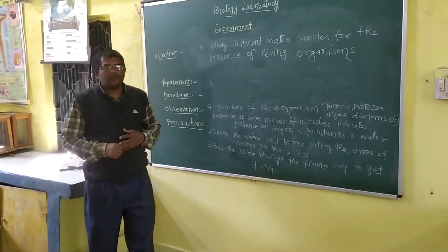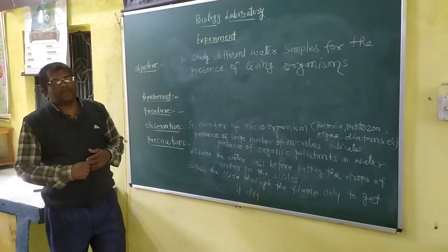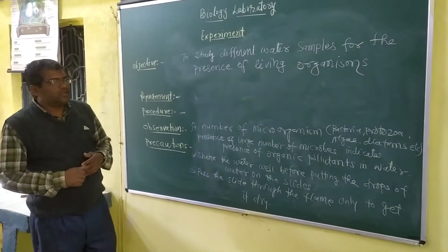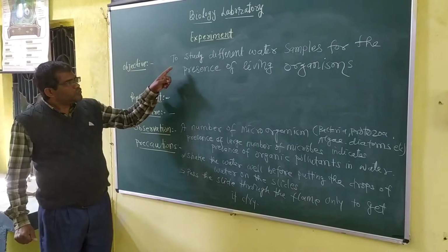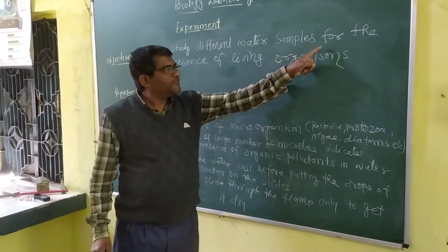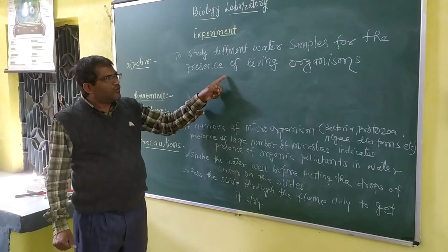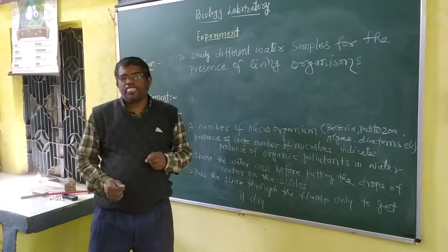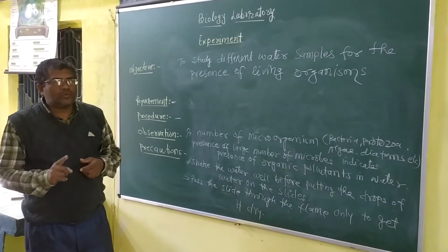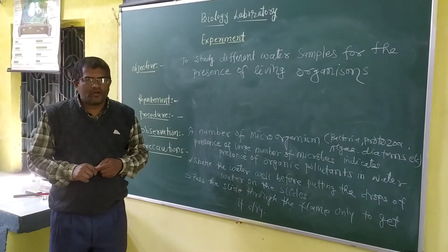Good morning, children. Today we are discussing and performing an experiment of the 12th class biology, and the experiment is to study different water samples for the presence of living organisms. For this experiment, we have to collect at least 2 water samples from your surroundings.